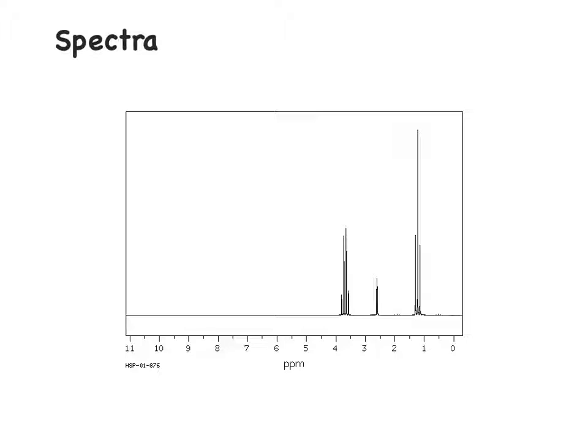In other words, there are 3 different hydrogen environments. And the number of peak splits is to do with the neighbours. Now, I would suggest to you that the one around about 1 ppm is probably going to be a CH3 or a CH2 group. And if you look back at the chemical shift information, you'll see that is where they seem to be concentrated.